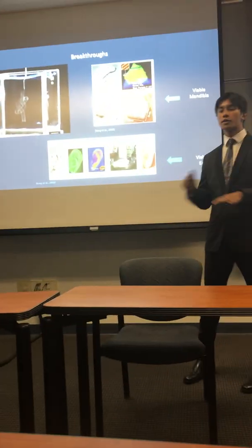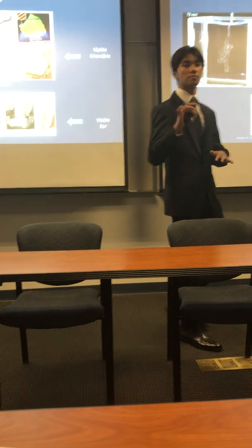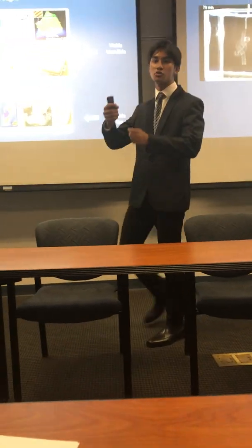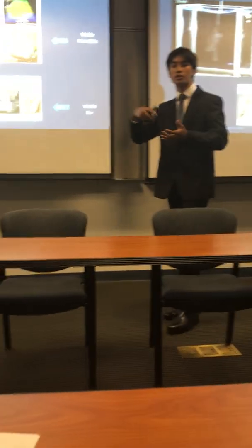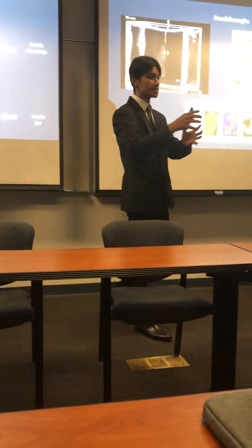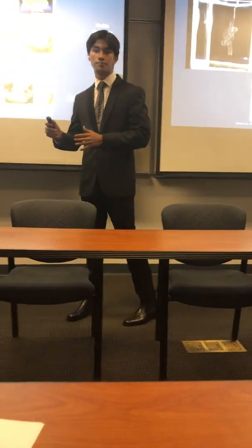To give you a quick introduction on what 3D bioprinting is, it's essentially normal 3D printing, but instead of using a plastic material, we actually load a syringe with live cells, and then we can extrude those into a gel medium. Once those cells are extruded into this gel medium, we can then manipulate how we want to place these cells, creating fine structures smaller than the cellular level.